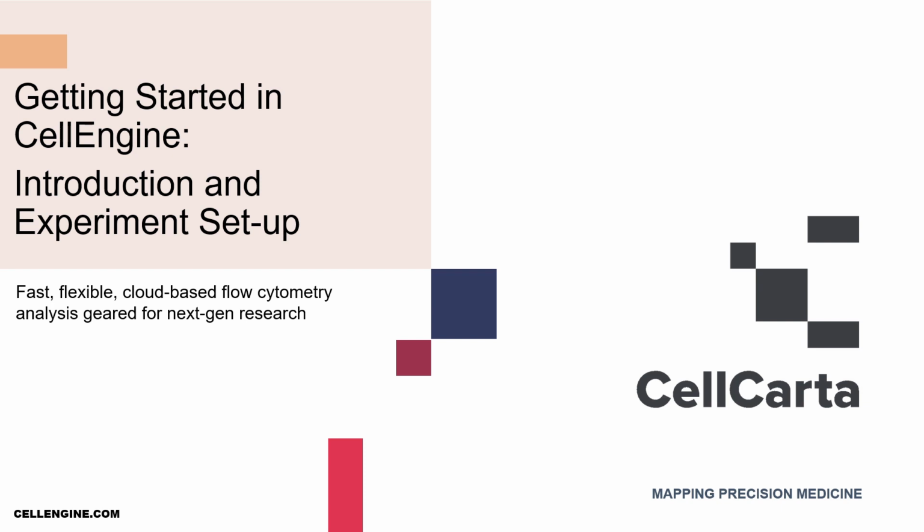This is the first in a series of videos that will teach you how to use CellEngine for cytometry analysis. Each video will take an experiment or a couple of experiments and go through part of the workflow step by step. At the same time, we'll talk about any tips or features that might help you as you do your own analysis. By the end of the video series, you'll be able to take CellEngine and analyze your own data, utilizing CellEngine's features to their maximum potential.